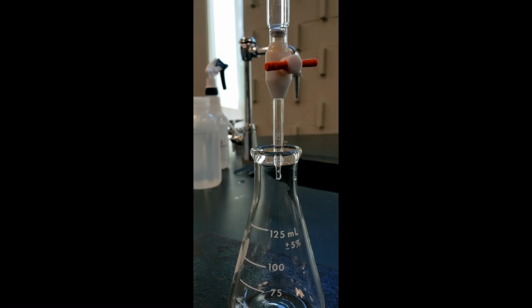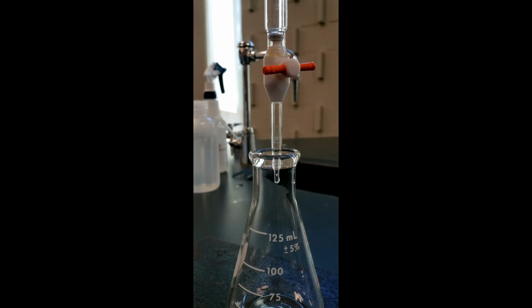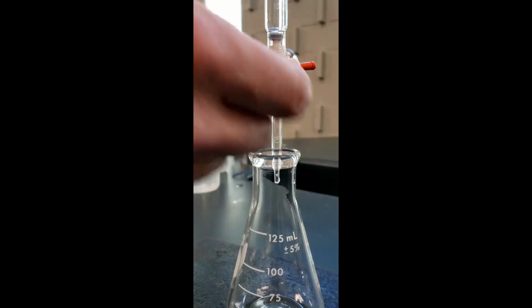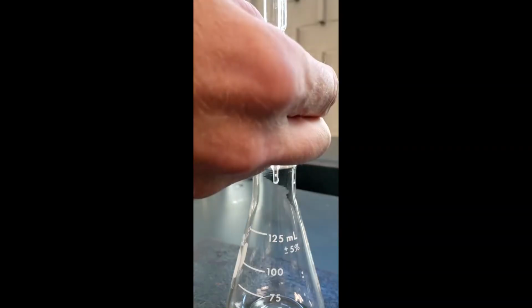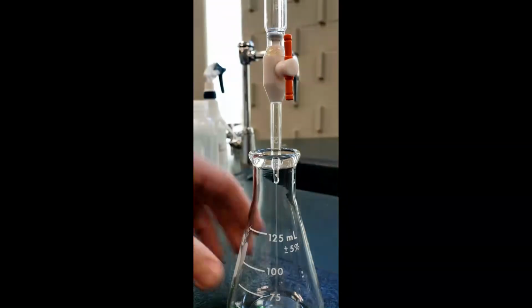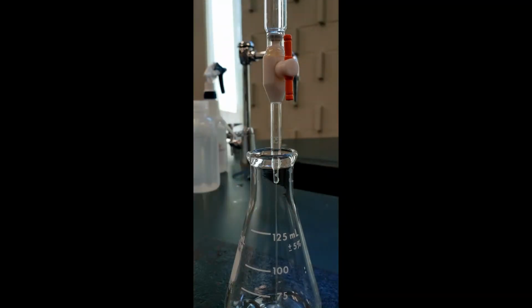All right, again, this is just distilled water in the burette. Just want to show you the valve here. When it's crossed like this, it means it's closed. When you turn it like this, it's opened. I think you can see the water going in.